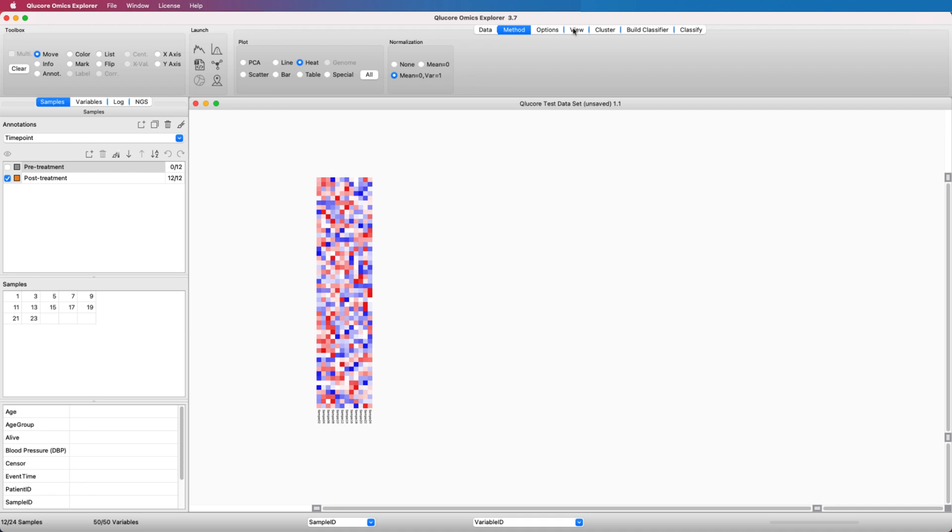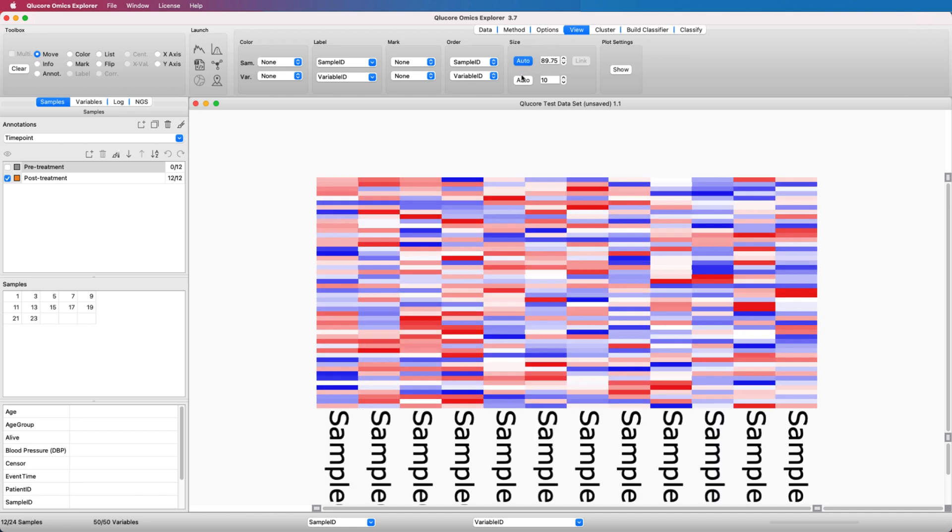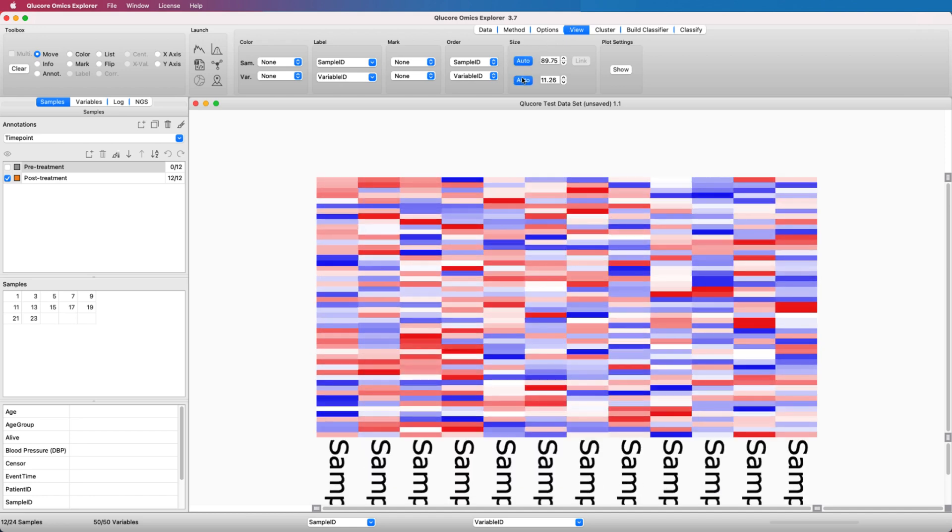The heatmap may be configured in many ways to fit your needs. This is done in the View tab. To see all samples in all variables, we press the Auto buttons in the Size selection.